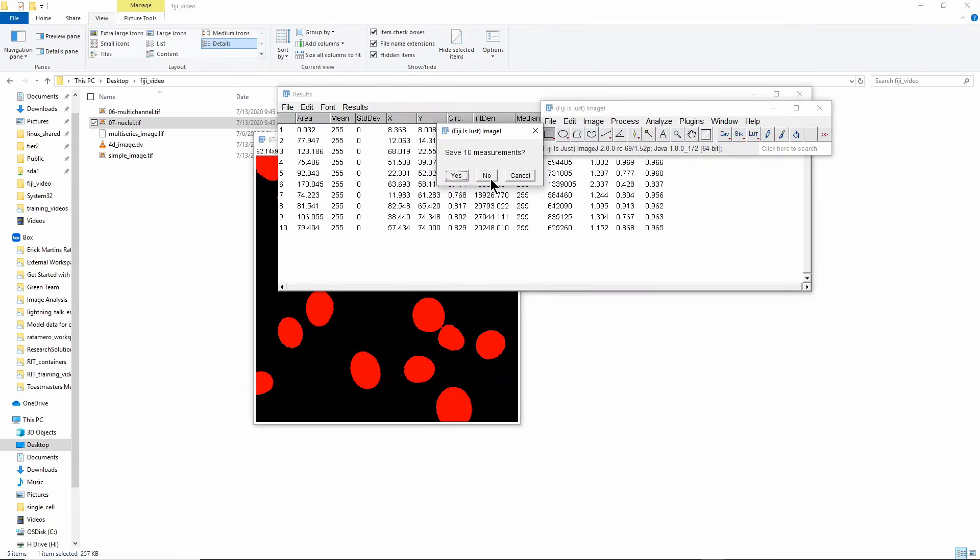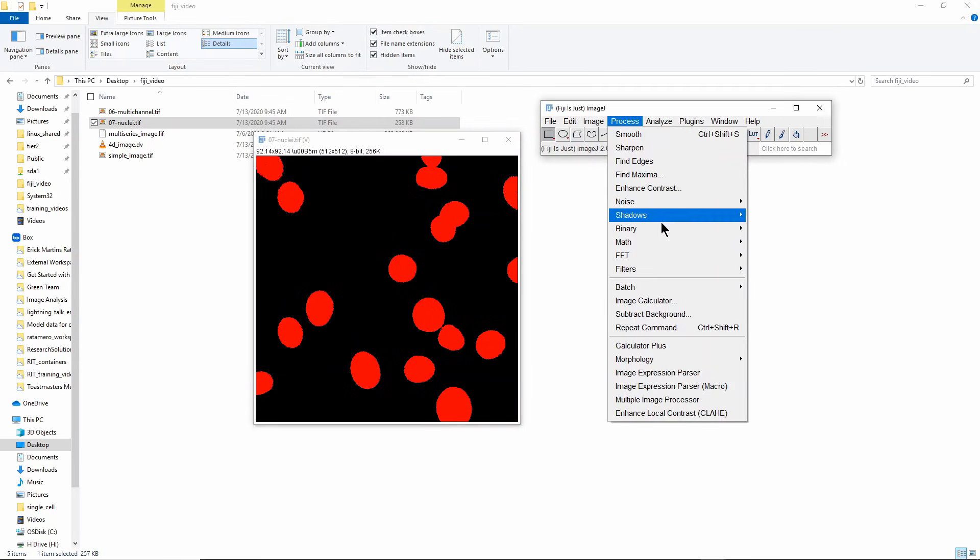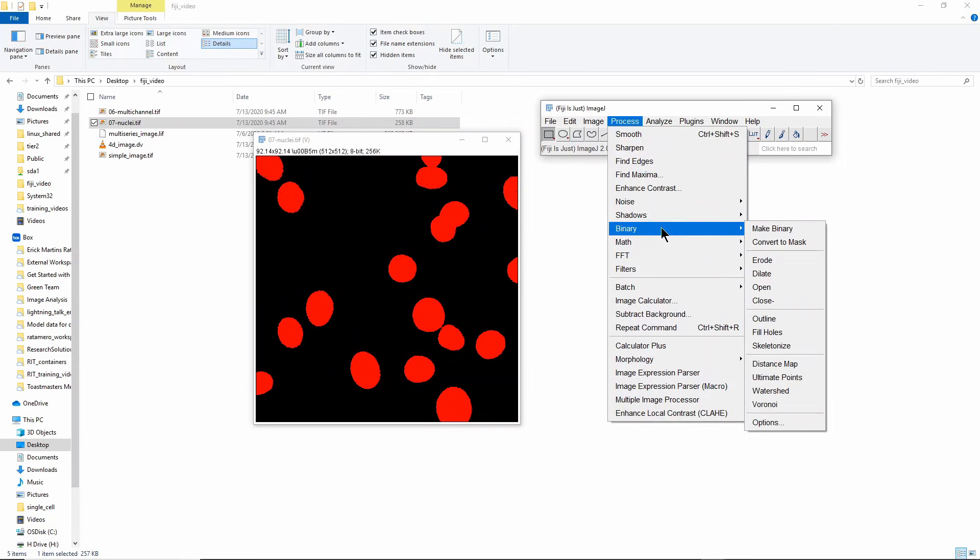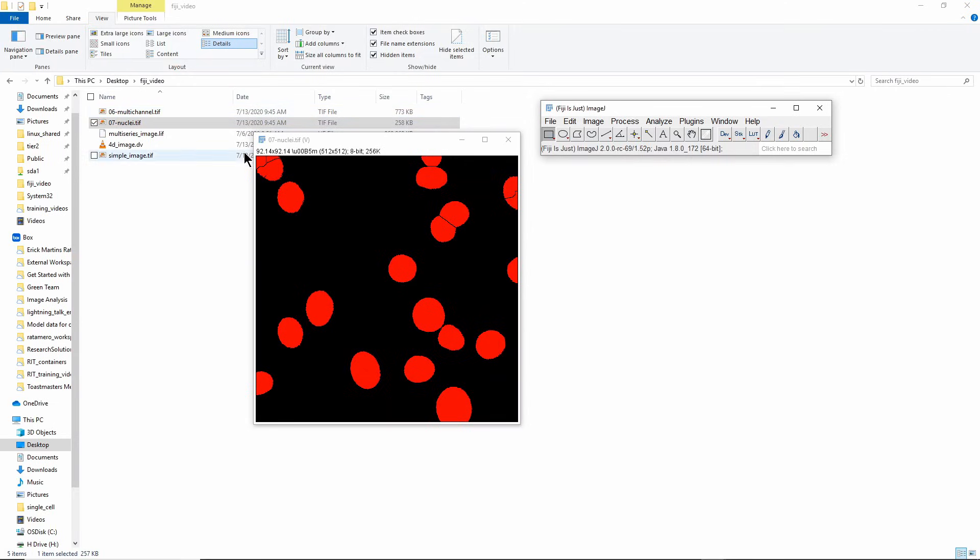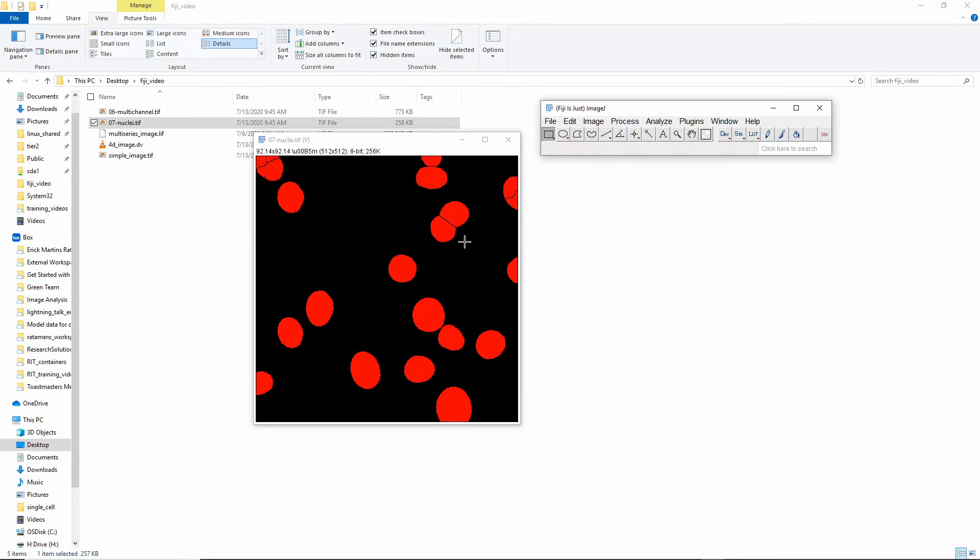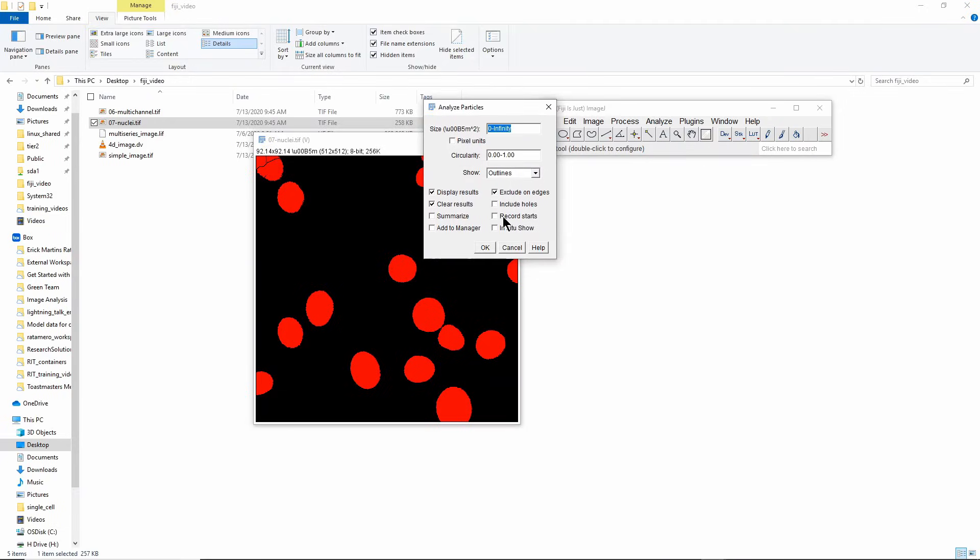One thing for example is you can use something called a watershed algorithm. If I click on Watershed here, you'll see that for example we divided these two into two, probably divided these two into two. It did some strange things here, it did some strange things here, but in general it split the things that were separate objects but were still being detected as one.